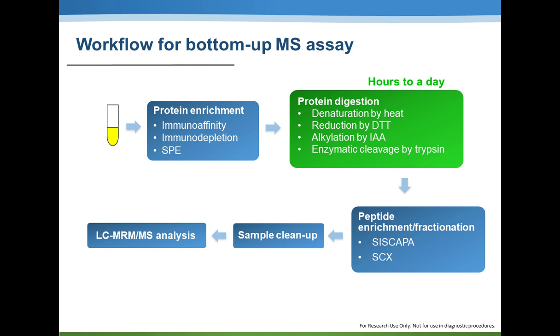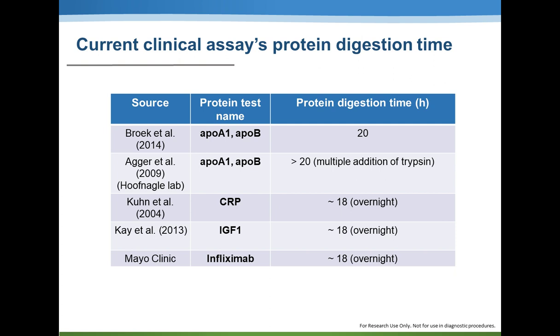In all of this, protein digestion is the rate-limiting step. It can include denaturation, reduction, alkylation, and enzymatic cleavage. And the whole digestion process can take hours to even a day, which makes it very impractical for many clinical scenarios.